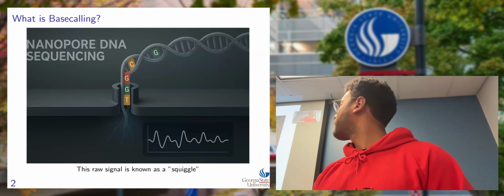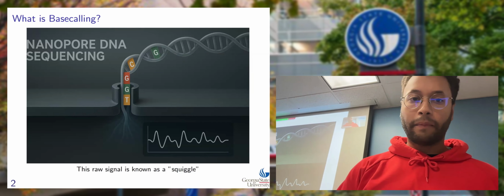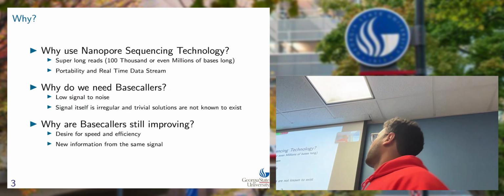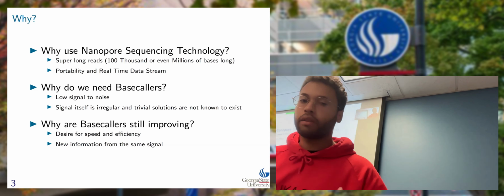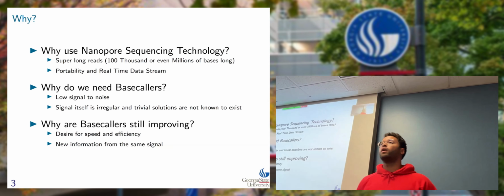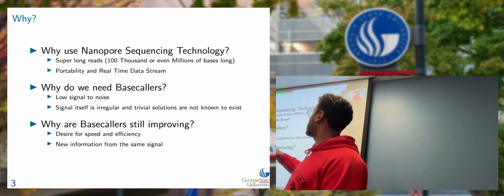Well, this is the what, okay? But moving forward, we always begin with the why. I talk about the what, the why, and then I'll get into the how. Okay, why? Why use nanopore sequencing technology?